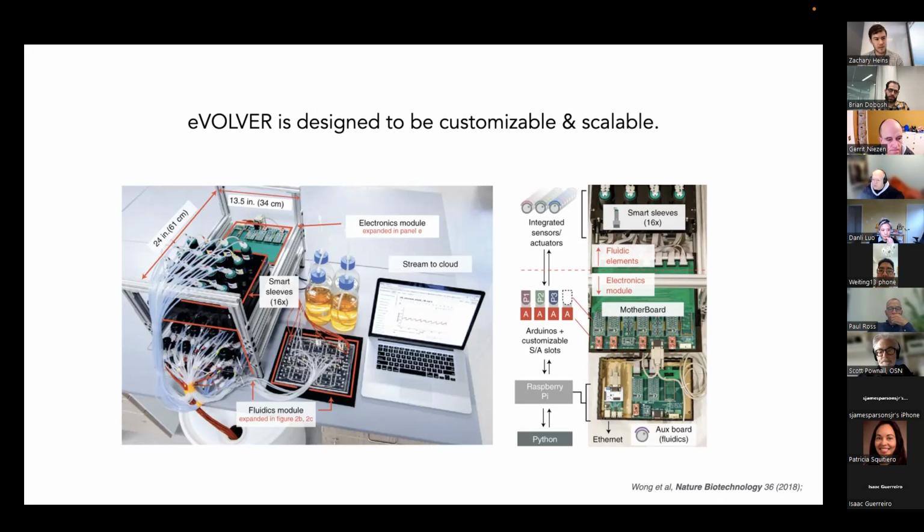Well, that would be wonderful. And then there was one other thing that you mentioned, glucose. And glucose. So my hack on glucose right now is to use test strips. With all the continuous glucose monitors around, there's got to be a way of rigging a CGM into this. So actually, I'm glad I'm on this slide.